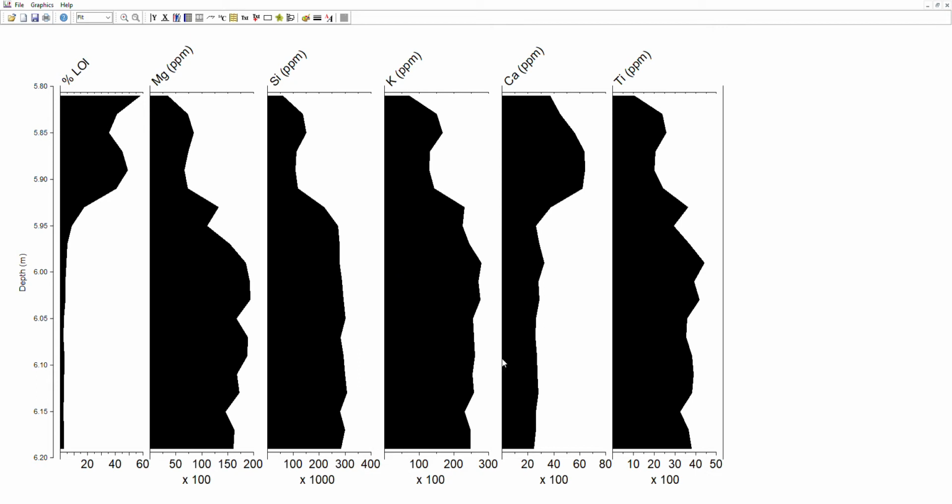Okay, so now we've got these plotted up. We can see the numbers; they're legible. We've noted what you need to multiply these by to actually express these in parts per million. So that's fine. Okay, as in terms of presenting the curves, that's fine.